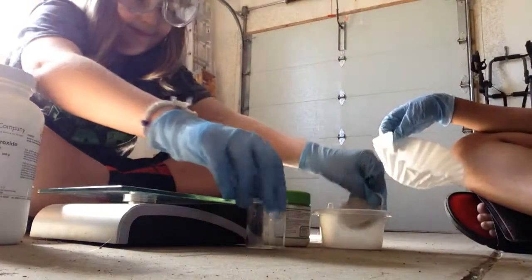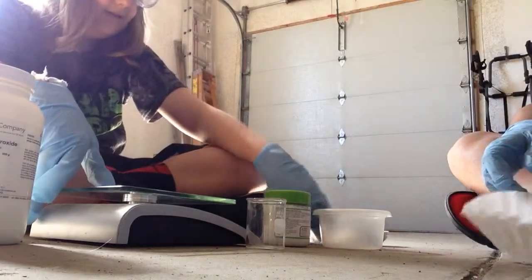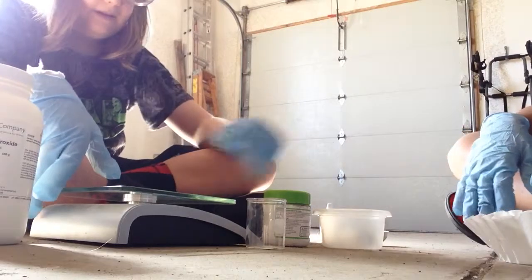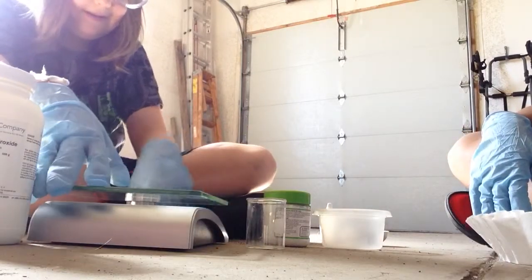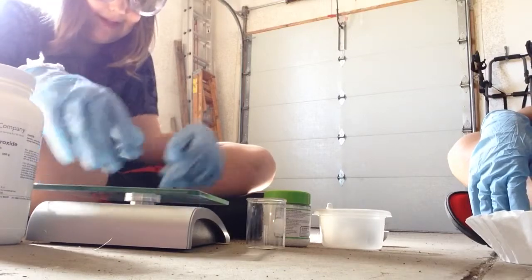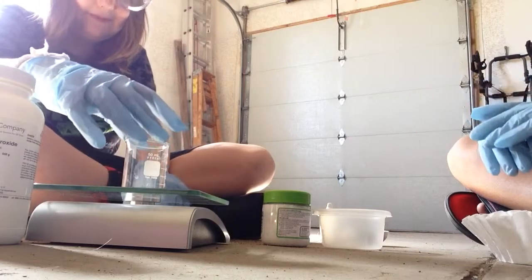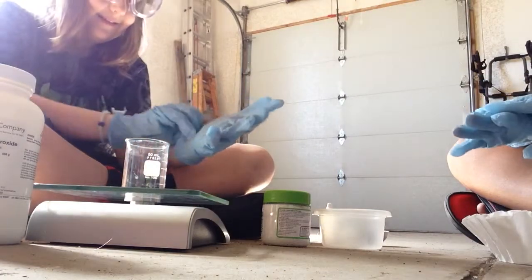Calcium hydroxide. The ladder with the calcium hydroxide — you don't let it sit out. Okay, actually turn that off. So we're gonna... stick your gloves on. Your gloves. Okay.